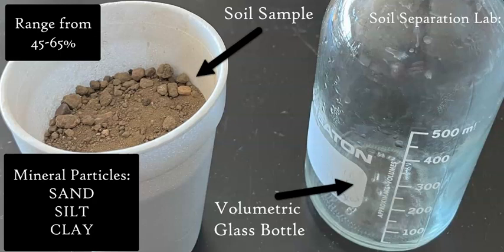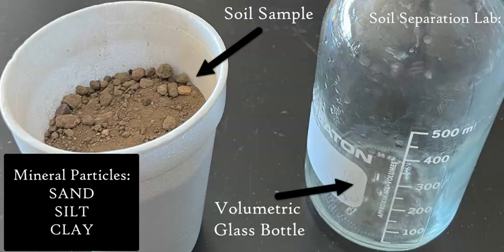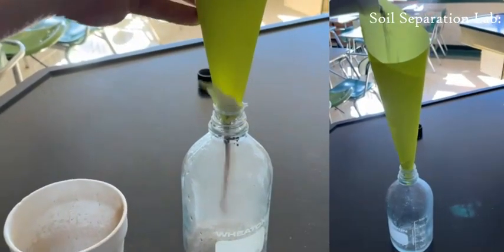So this separation lab is key to looking at soil and the soil properties, because the texture, which we're trying to figure out by using this lab and to figure out the separation, the texture is the overall combination of sand, silt, and clay within the soil profile, and that kind of controls how the soil has various characteristics like the water holding capacity, soil colloids, and how nutrients flow, and how infiltration rates are affected, and how there's general growth and biomass, and how the soil is going to hold all of the biotic components. So it's a very important lab to figure out.